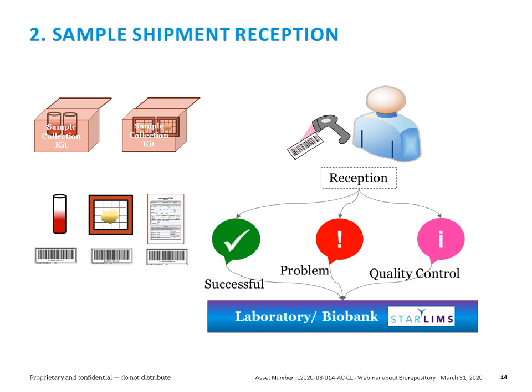For the reception, another thing that the LIMS needs to do is validate the items. Obviously, every time that we either scan or manually enter some kind of ID, the system is going to check whether it knows about that sample, that kit, or that shipment. And if it has that data, then it will be successfully validated, and it can be acknowledged in the system that it was received.